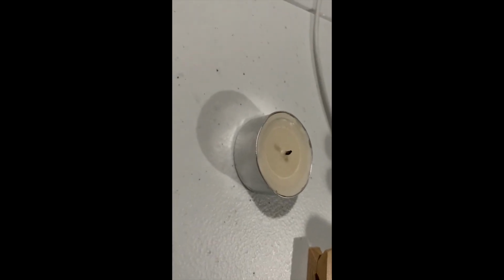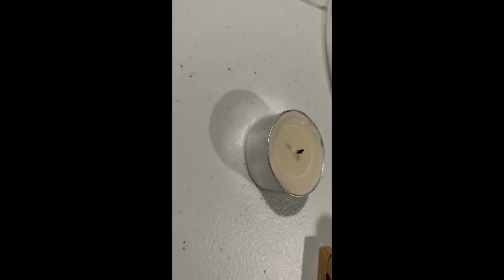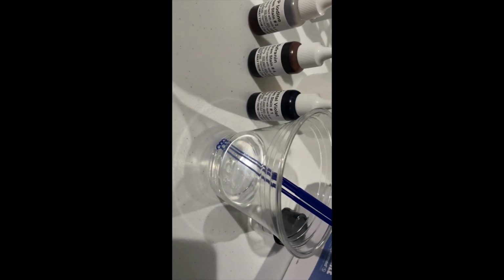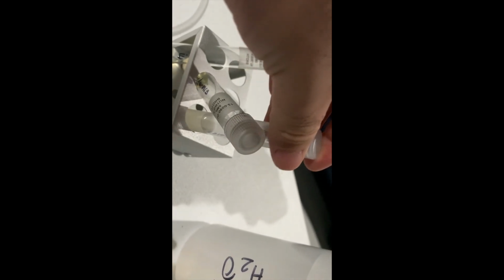So again, I'm going to flip the camera and just show what supplies I'll be using for this experiment. Okay, so again, I have my 3 slides there. This T-light is going to be used both to heat fix the specimens themselves and also to sterilize my bacteria tubes, if you will. The clothespin is to hold the slides while I'm heat fixing them. My gram stain kits. These are the inoculation loops sitting in some alcohol to sterilize, and then I have my culture tubes here, E. coli, S. epidermidis, and S. cerevisiae, that I will, of course, obtain samples from. So with that being said, I'm going to go ahead and don my PPE and get started.